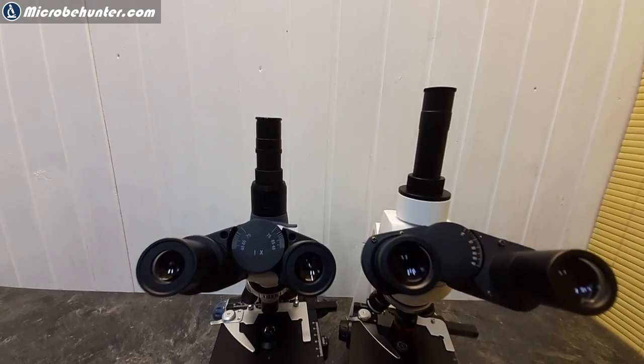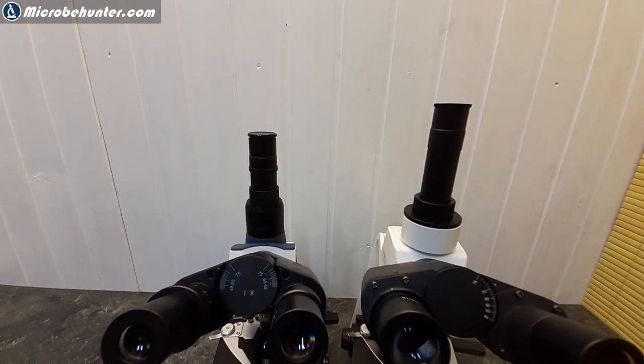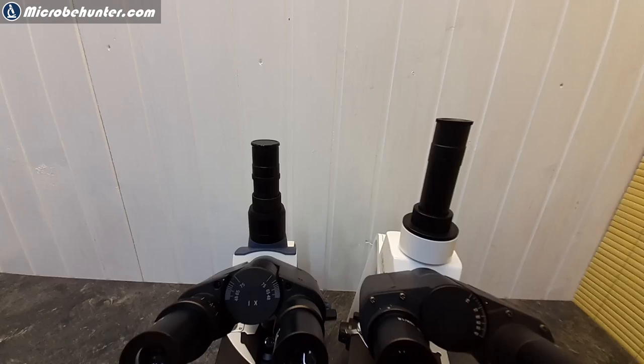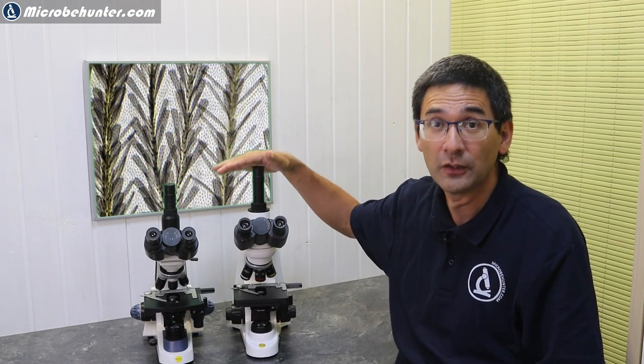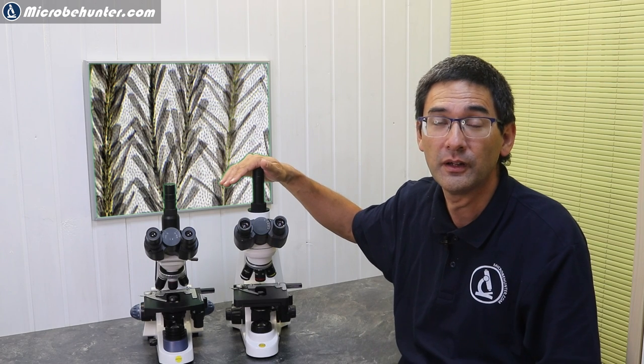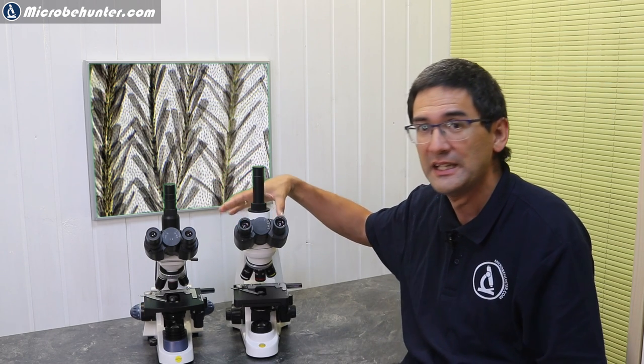Size is of course important, but also is mass. Both of them have a similar weight. The 380T has approximately four kilograms. The Stellar One is a little bit heavier with four and a half kilograms, also because it is here on the side a little bit wider.